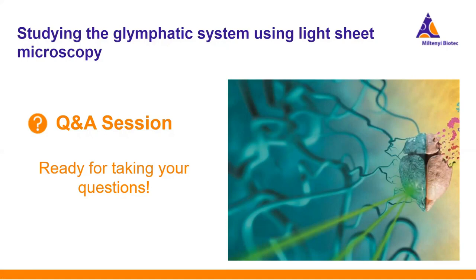So I would say the muscle tissue is probably the hardest to clear. However, there is at least one paper that tested different kinds of clearing protocols for clearing of the heart. So I would say that any tissue can be cleared.